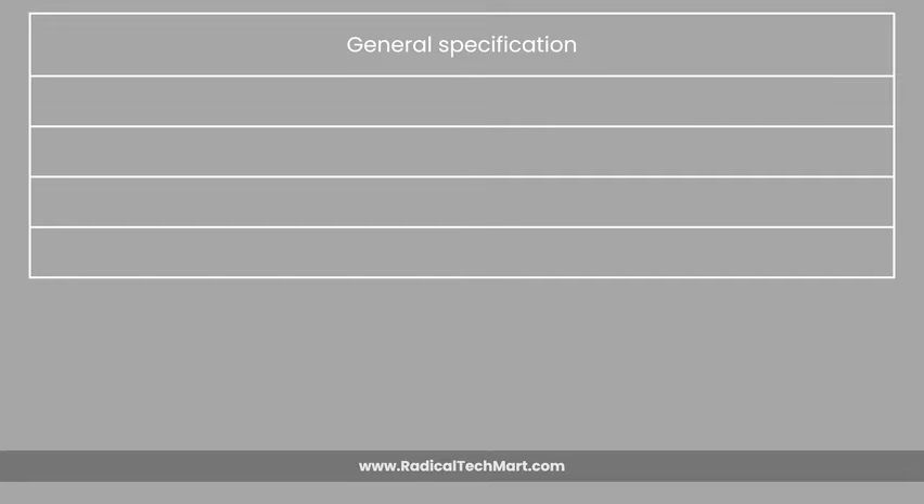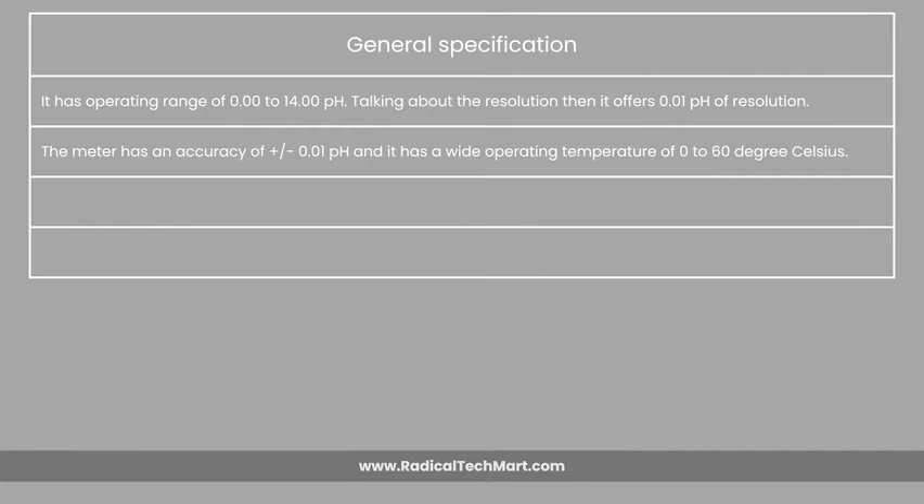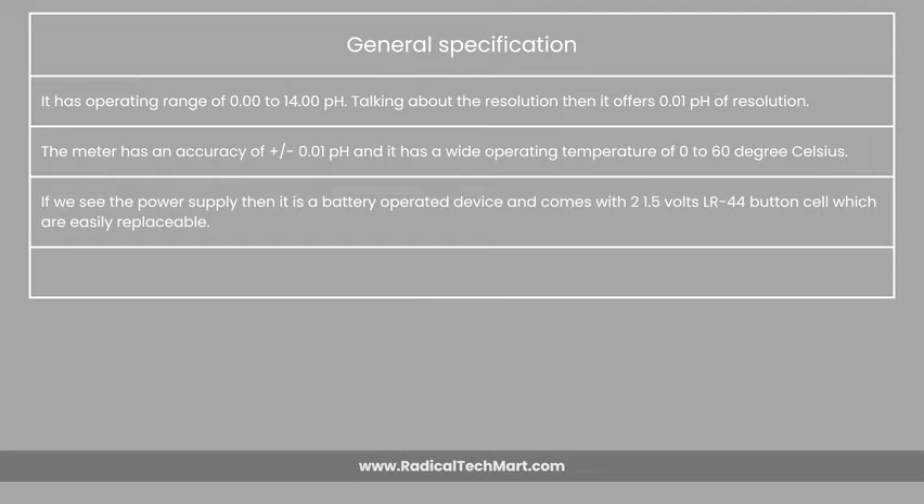General specifications of the pH meter are as follows. It has an operating range of 0.00 to 14.00 pH. Talking about the resolution, it offers 0.01 pH of resolution. The meter has an accuracy of ±0.01 pH and a wide operating temperature of 0 to 60 degrees Celsius. For power supply, it is a battery-operated device and comes with two 1.5V LR44 button cells, which are easily replaceable.